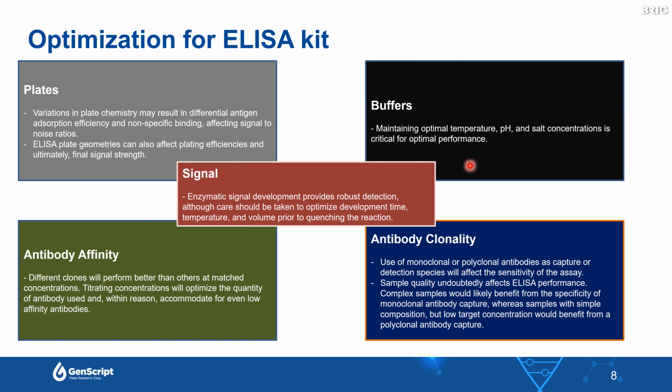When it is in a high temperature condition, the incubation time will be shortened, otherwise it will increase non-specific binding. For this reason, room temperature overnight coating and 37-degree blocking, and then after that, room temperature for binding buffer incubation is the most appropriate condition to work with. Again, optimizing the various conditions like temperature, pH, salt, and irrelevant blocking protein concentration will benefit ELISA kit development.